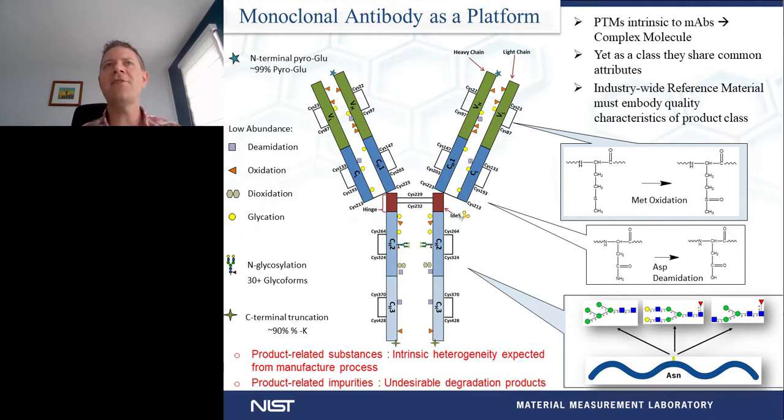So going back to the structure on the left-hand side, thinking about the monoclonal antibody as a platform, it's true that each individual type of monoclonal antibody is going to have different levels of methionine oxidation. They'll have slightly different post-translational modifications. They'll even have slightly different sequences at the top of the structure in the FAB region. But when we start thinking about these attributes and how we're going to measure them, every monoclonal antibody we're going to approach in the same way.